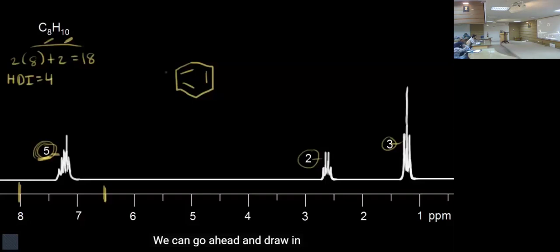What about this triplet? This is 1. So 1 is coming from here, and 1 is coming from this one here. So 1 is to 2 is to 1. Then the triplet will be 1 is to 2 is to 1. So that will proceed further.